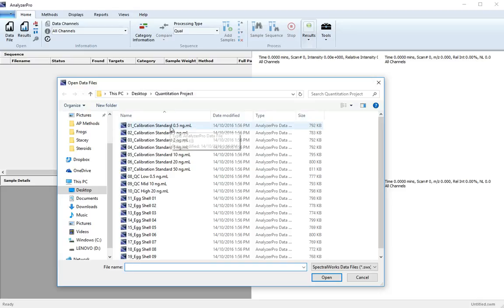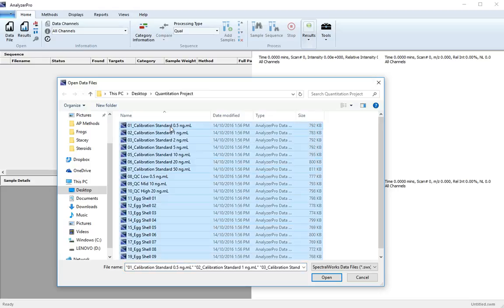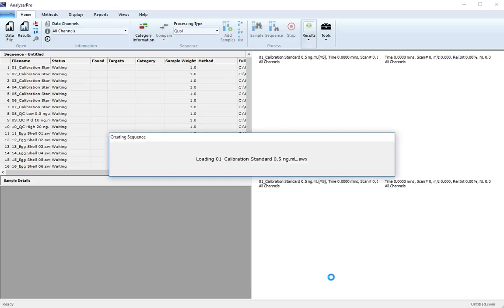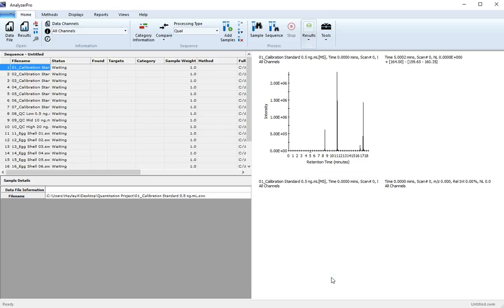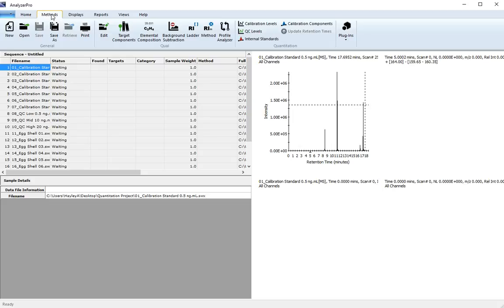From the methods tab, select all and open. Your next step is to set up your processing method. From the methods tab, start by selecting calibration levels.